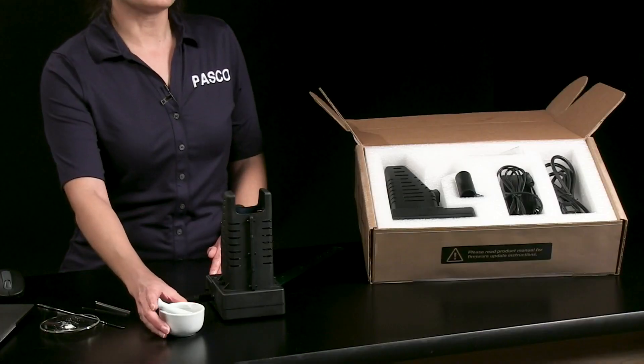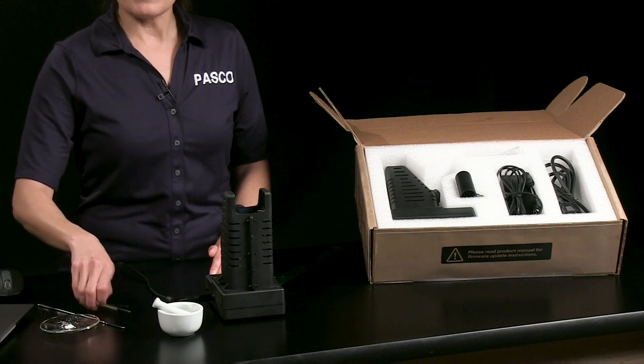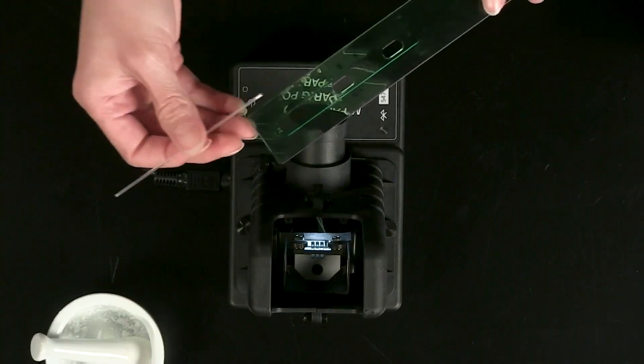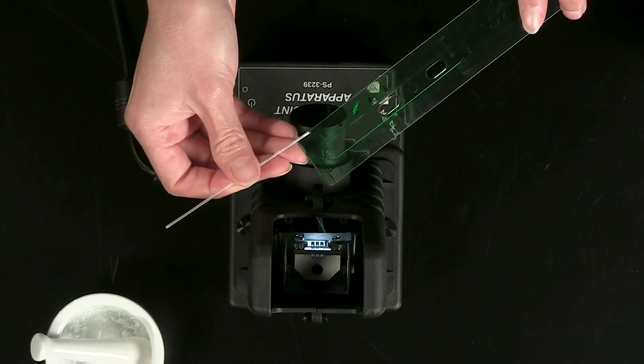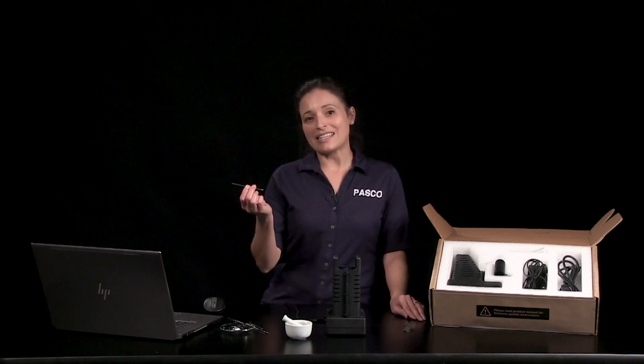Prepare your dry solid sample by grinding it to a fine powder and pack the sample to a height between two and three millimeters. Here's a sample of stearic acid.